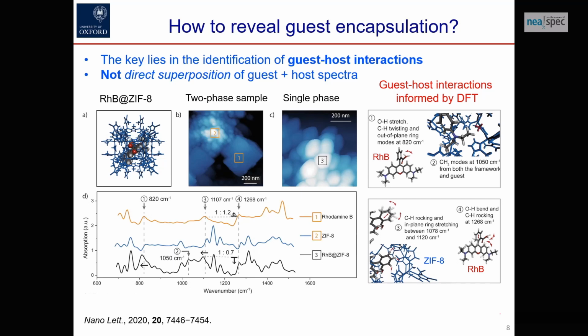And this came about not from linear combination of the spectral information alone, because linear combination typically means they are just on the outside or just attached to the surface. We are actually looking at interactions whereby the bands are shifting, or the ratios of characteristic bands are changing.